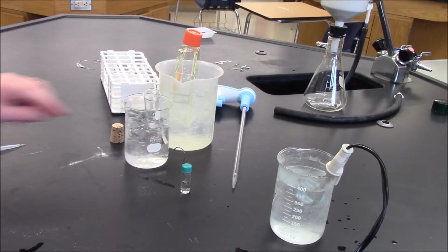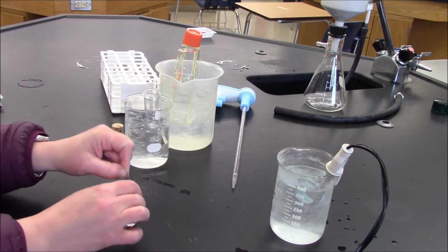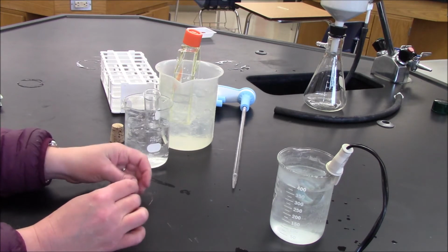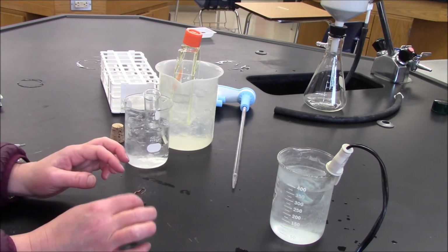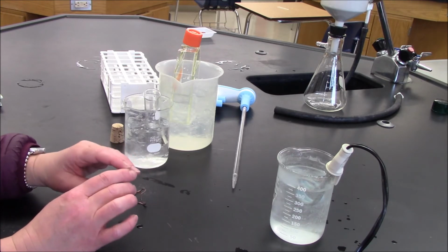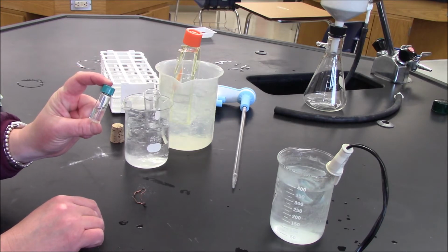Alrighty guys, I'm back. It's been 10 minutes plus a minute for this to cool on the desktop. So I'll undo my copper handle now. What my instructions are telling me to do is to carefully pour the contents of my reaction vial into the test tube, which contains the ice water setup.